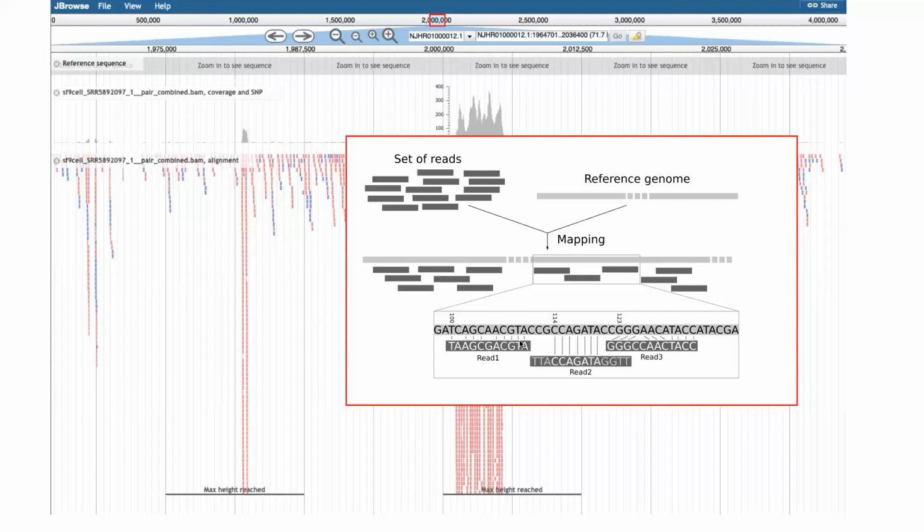So this mapping quality, if we have a full pipeline that we designed, we actually can play around with the quality, because it's obvious that some sequencing errors will be there. Also, there will be some other issues that we will discuss in our next lecture, where we will look at how we can overcome this challenge with mapping quality that essentially is not ideal.